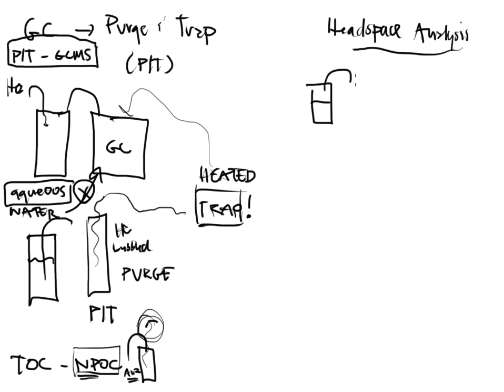What happens is that this vial goes into an oven, and it will sit there and heat up. The good thing is that if it's a liquid or a solid, it doesn't really matter. Both are going to get warm, get toasty, get happy. But there is a cap on this vial. There's a cap on the purge and trap vial too, so it's not going to go anywhere. I'm not going to lose any sample. The only thing I'm doing is putting it into a nice little jacuzzi, because sometimes the molecules need a little bit of heat to go volatile.